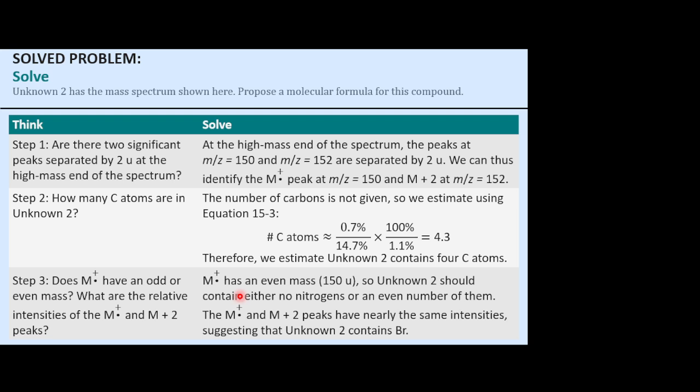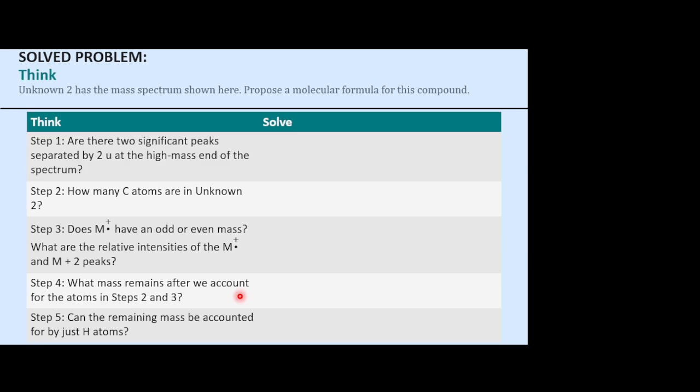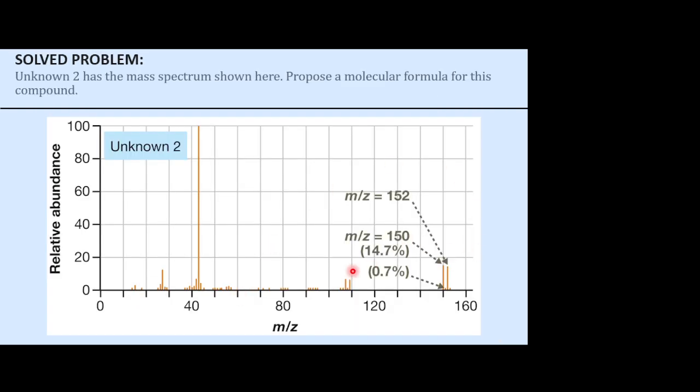Okay? If you wanted to try to figure out if it's chloride or bromide, the easiest way to do that is to look here. And we see our drop off here. We don't really have anything that corresponds to a 35, do we? See that? We have something that corresponds to like an 80, don't we? And that doesn't have the 2 peaks, the double peak, does it? They're almost equal intensity. Okay? And so what you'd end up seeing is, yeah, that probably is your bromide, isn't it?